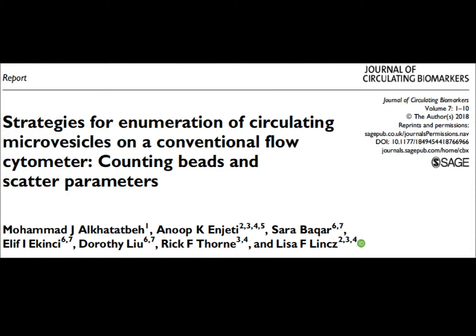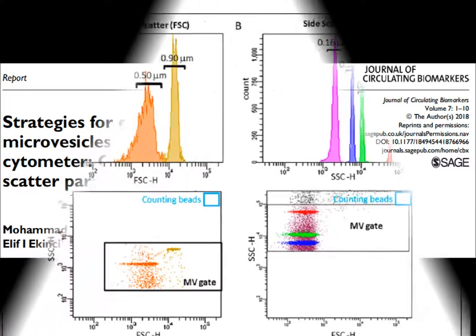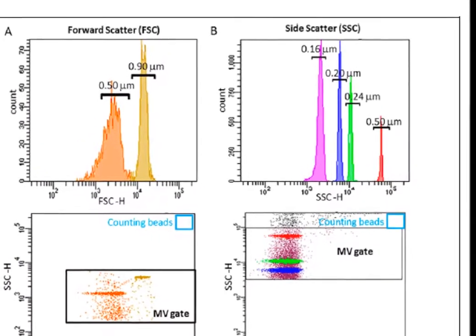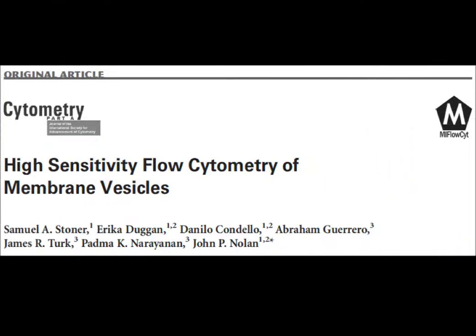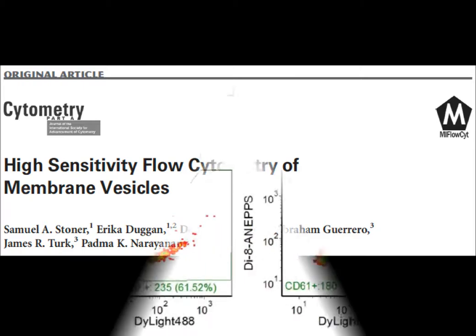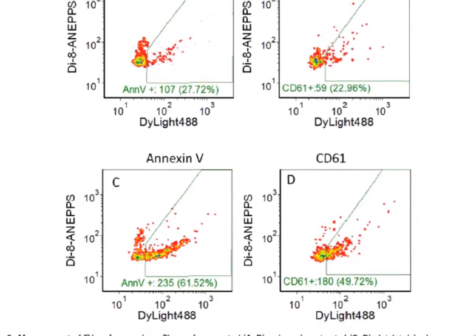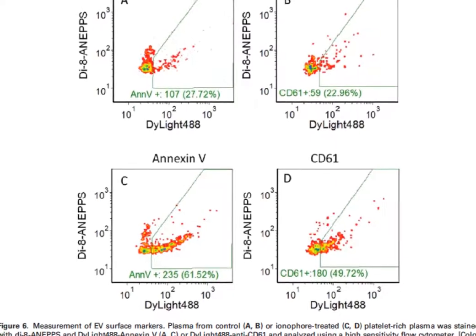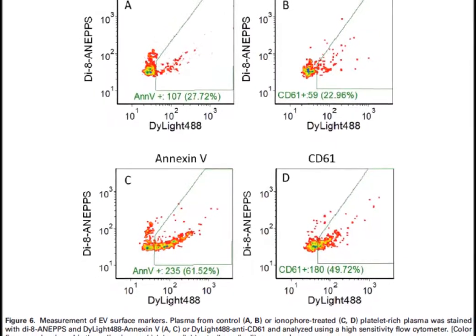But that has not stopped a huge number of publications, with the majority using a comparison technique with small beads to calibrate their instruments, but the results are less than satisfactory. Even when groups make determined efforts to modify instruments and reagents to get the best possible results, it's still a very complex process to obtain data that can be verified.